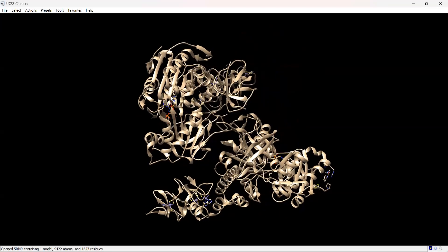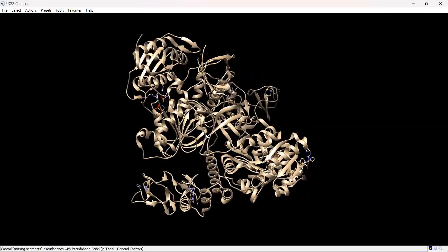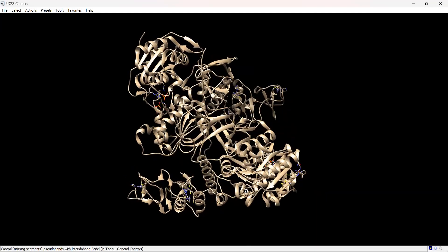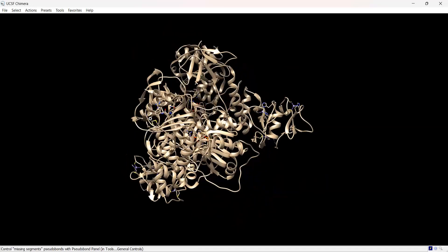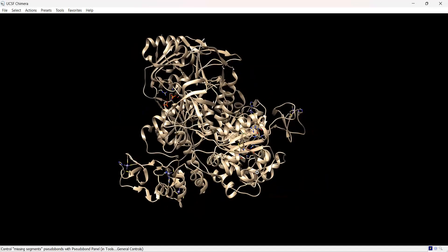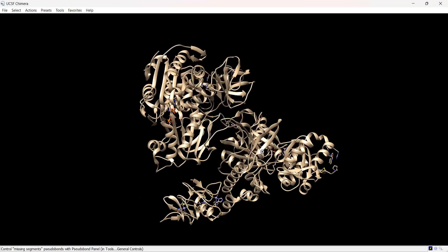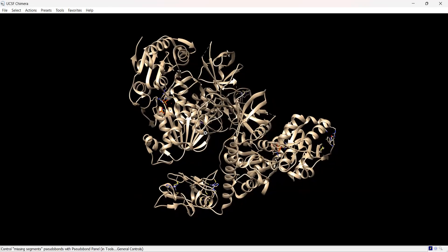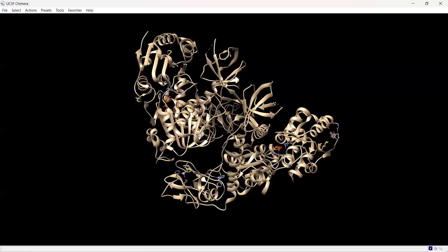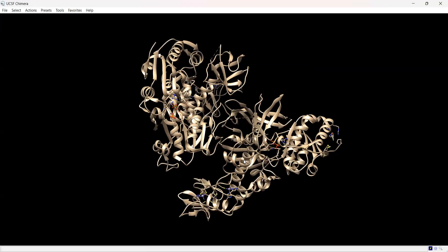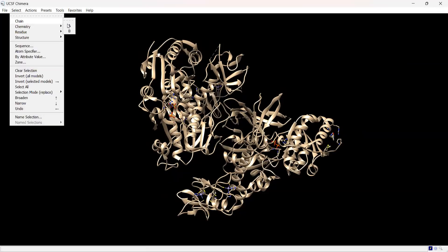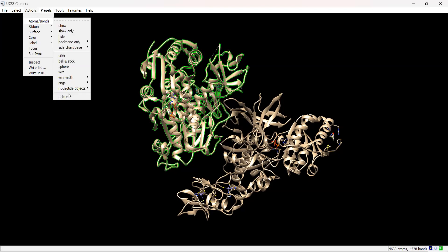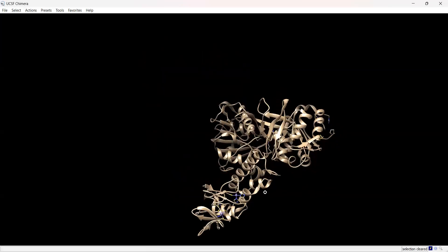However, when we inspect the pocket of interest up here at the C-terminus B end, only one of these copies has the fragment bound to it. We're not really interested in the other chain since it doesn't have any fragments bound and we only need one chain for our docking. So we're going to select the chain we don't want and delete it.